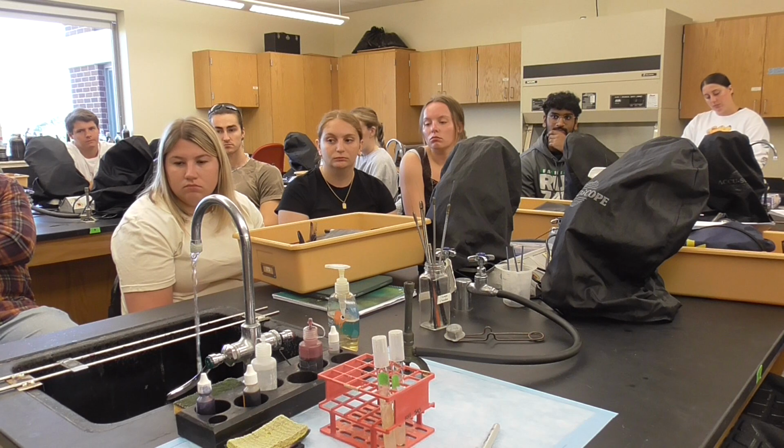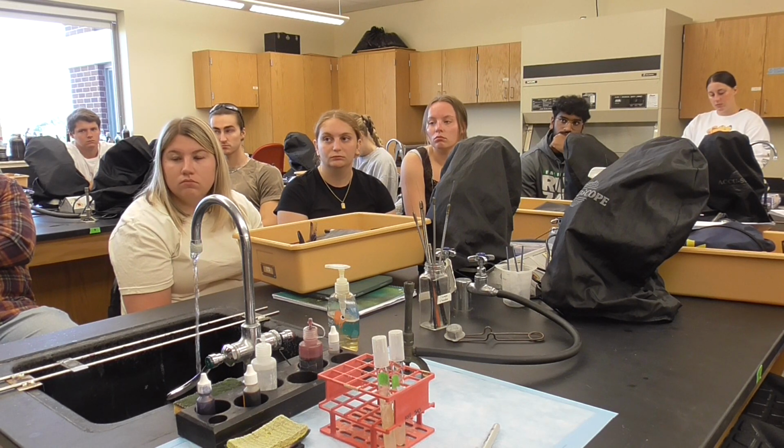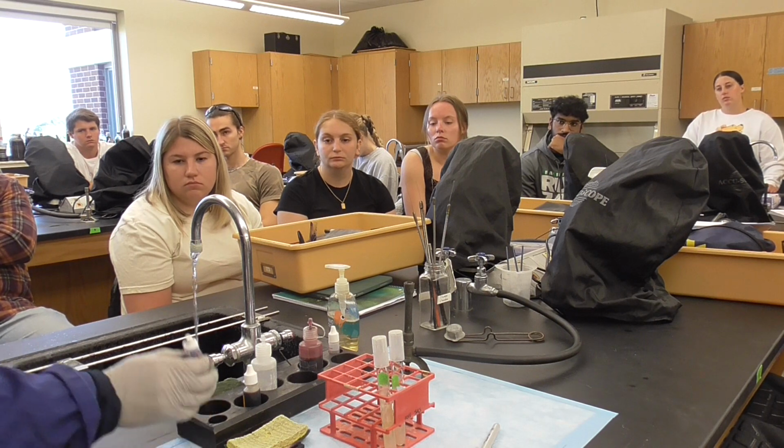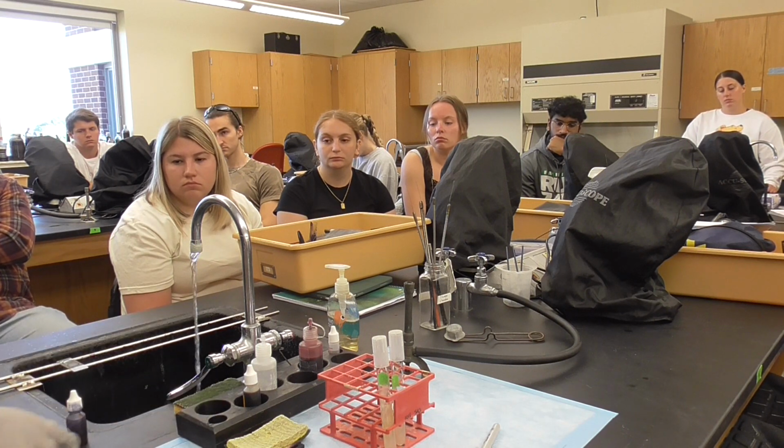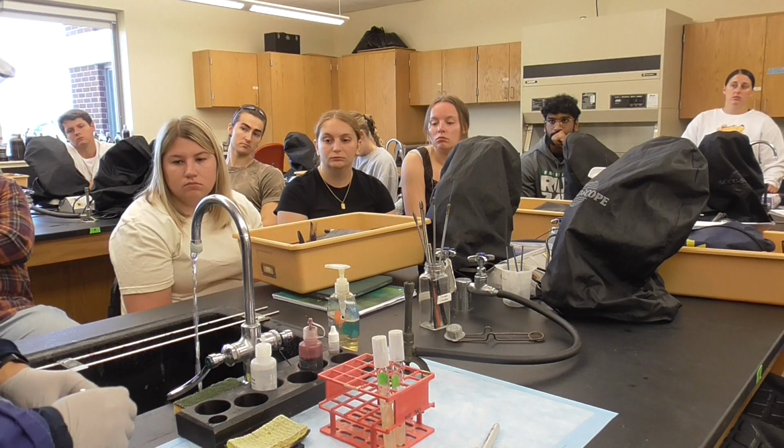Put this on the side. You can see, whenever you touch the dye, wear the goggles. Now, the first time you do the Gram stain, make sure it's in order. Crystal violet is a very purple color. Second, the Gram iodine looks like a brownish color.